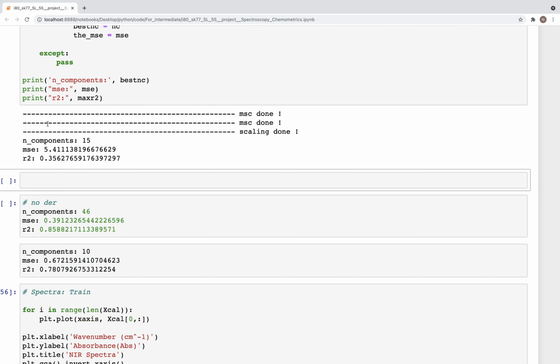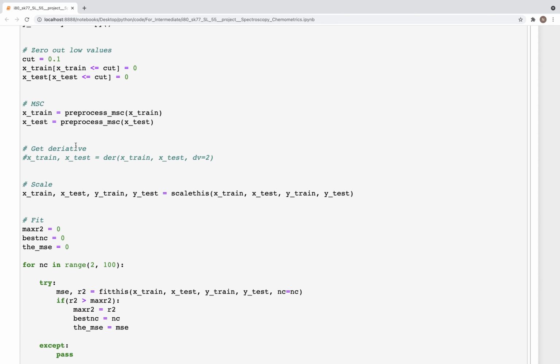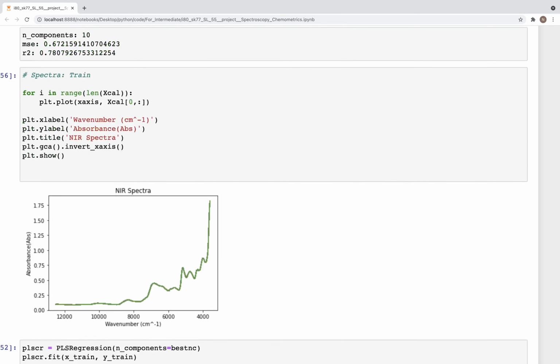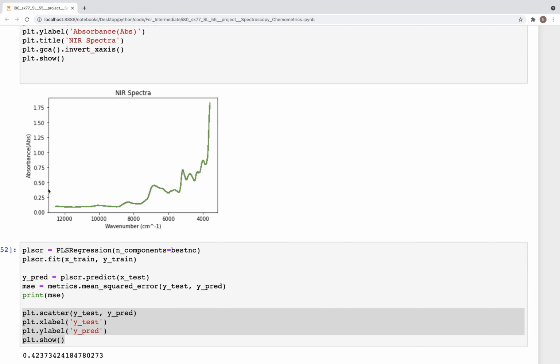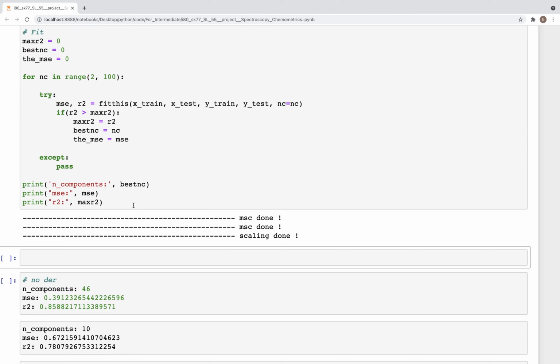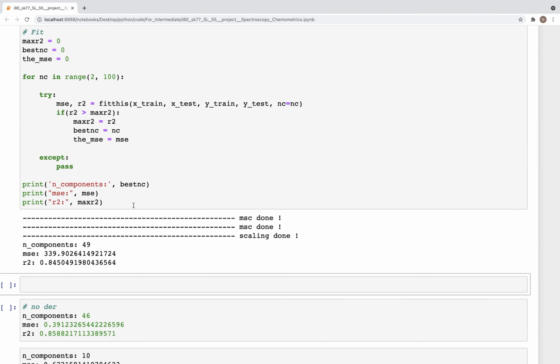So if you go down, the MSE increases drastically to 5.4, so that's no good. And if you go up to 3, that is not advisable, because you are right here, so you are eliminating this peak from the spectra, so you don't want to do that. But still we can look at the result and see if that changes anything.